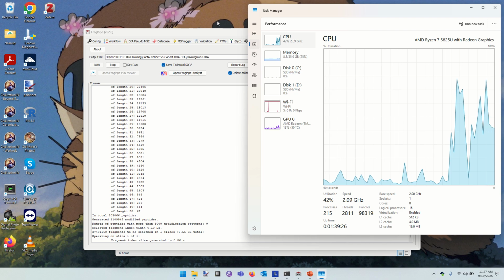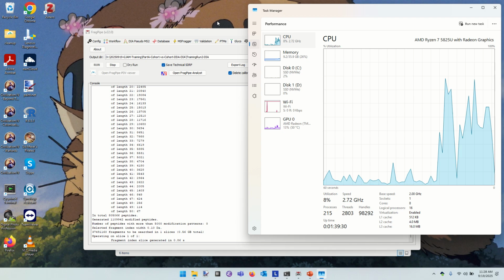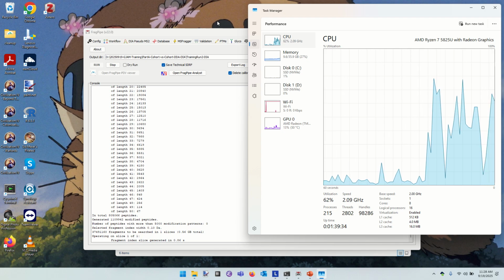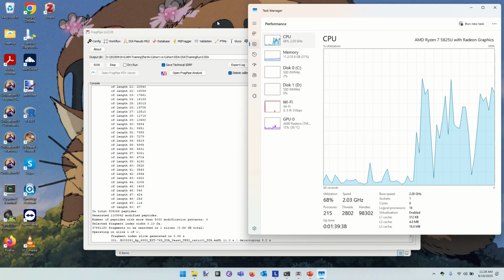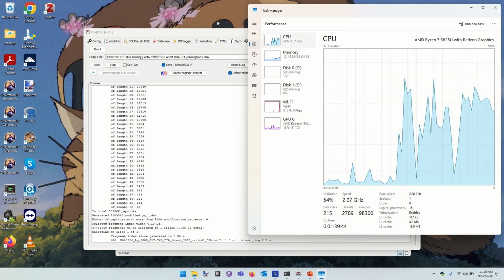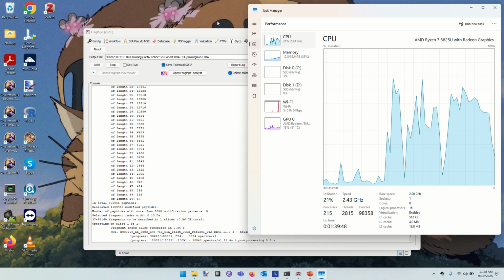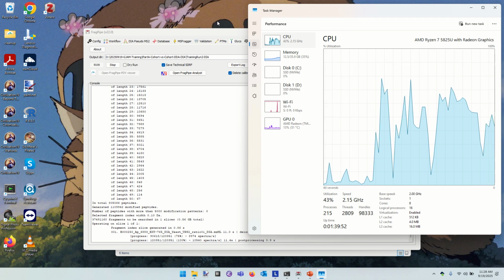Yes? For the DIA-NN configuration, do you know which default parameters FragPipe will use? Because with IonQuant, we activated the MBR. Yeah. DIA-NN can also do that. Yes. But you have to specify it. Do you know if FragPipe does that? The easy way to check would be to do the dry run option over at the left, because it will show you exactly which commands will be issued along the way.